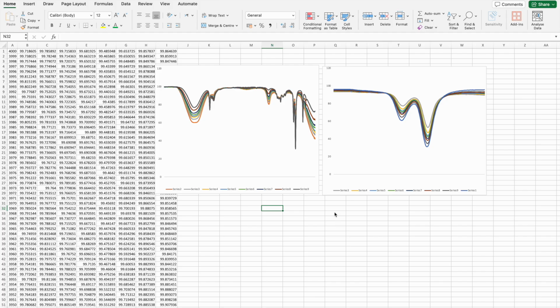And so in this example, I'm going to show you another application of the calibration curve and the calibration standards to identify an unknown. What we have in this chart is a series of calibration standards done in FTIR. On the left, you can see the entire spectrum, and on the right, a zoomed in spectrum of a region of interest, these two peaks, where I created a bunch of calibration standards of ethanol, and you can see that these peaks are sensitive to the concentration of ethanol.